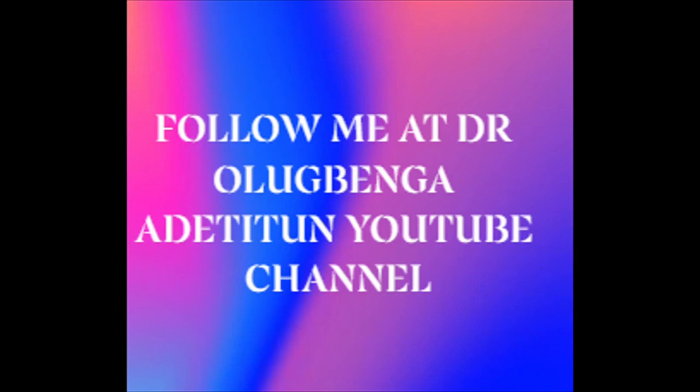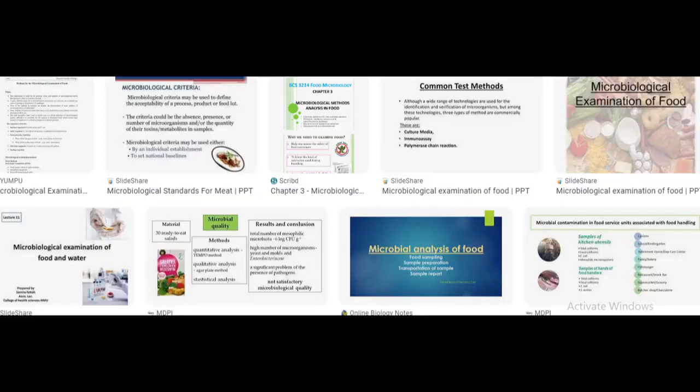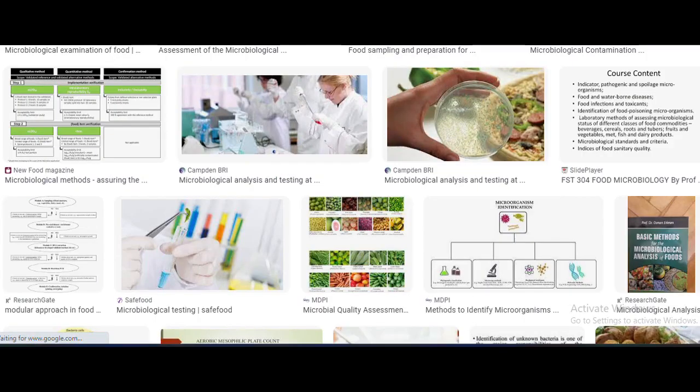And you are in a lab in a food processing company. You are in Cadbury, Guinness, Nigerian Breweries, International Breweries, Nestle Foods, Cadbury Nigeria Limited, another food company where they make Maggi, spaghetti, different kinds of foods. You want to check after that batch of production whether there is E. coli there. Then you have to wait for 24 hours. Does that mean after every batch you have to wait 24 hours before the next batch? So what will the workers be doing before the test results come out?